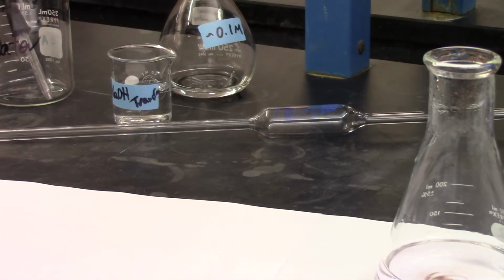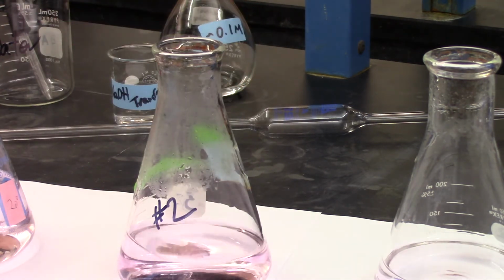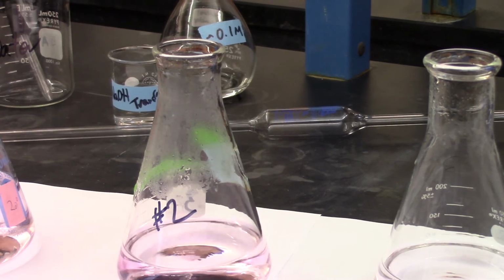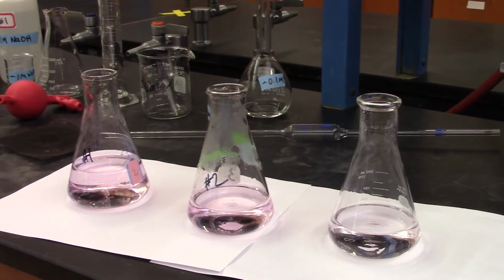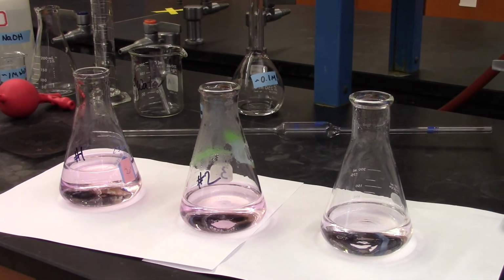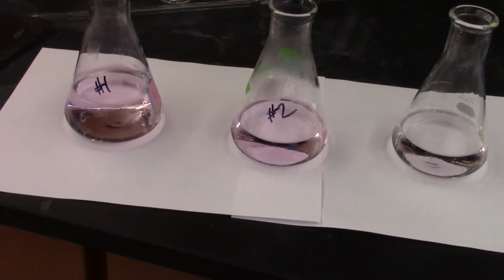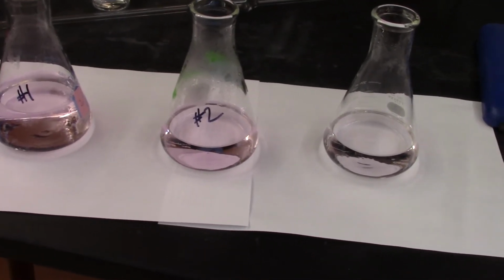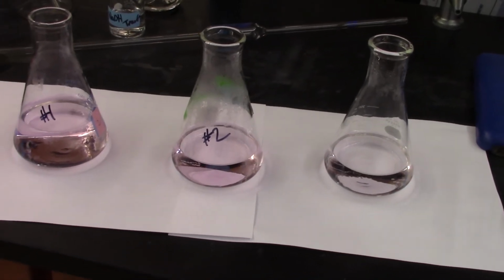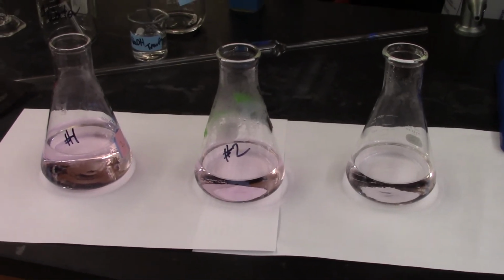So now I'm going to show you my flasks. This is in order from the titrations that I did, with this one over here being number 3. Zoom out for you. You should see how the color gets more faint as I move from flask to flask, with the last one being number 3. I didn't label it, sorry. But you can see how light it is compared to the others. The first one will usually be a rough titration, and then approximating, you'll be able to figure out about how much volume you'll need.